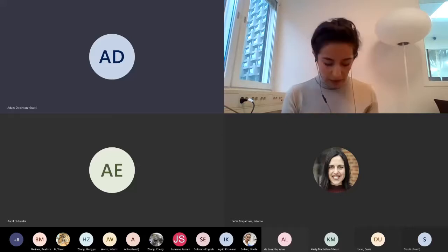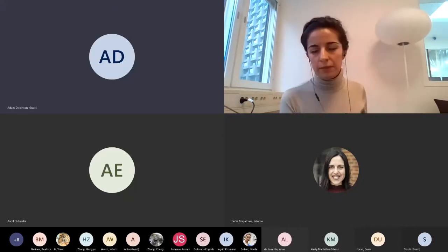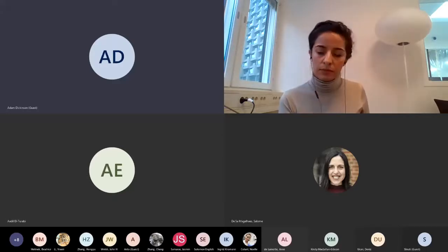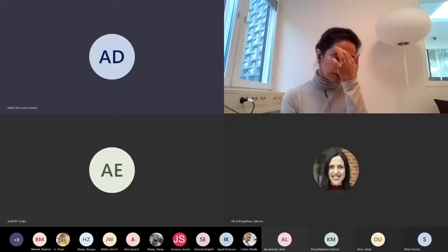There weren't many of them around. So in terms of the input data you provide the CNN, you need to ensure you confidently have enough of those particles present in a set of images. You may need to take lots of images to generate that data, and then you'd hope it would be pretty faithful in how it identifies those particles.